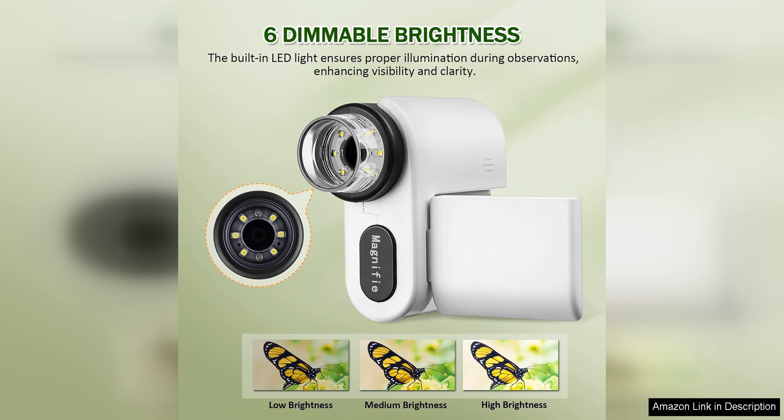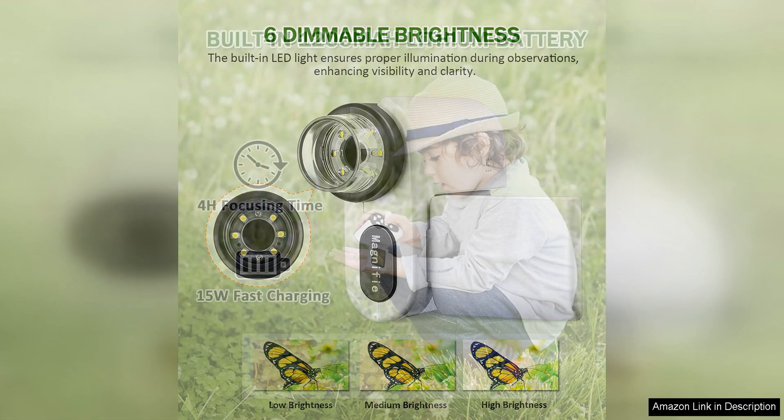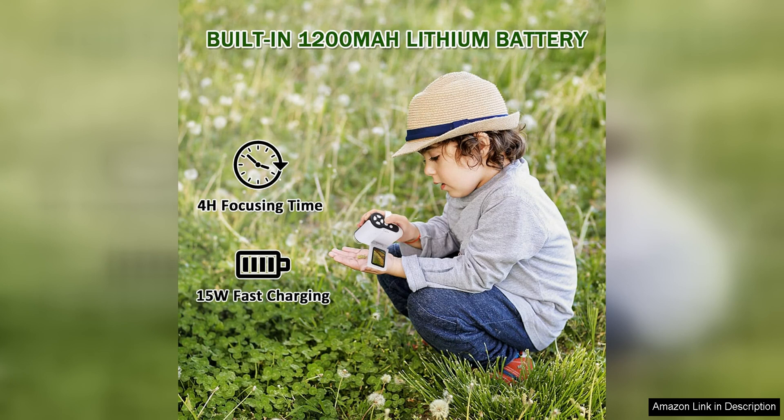The microscope comes with a set of prepared slides to get kids started on their scientific journey right out of the box. Additionally, the device is compatible with a wide range of slide types, allowing children to explore a variety of specimens and materials from plant cells to insects and more.